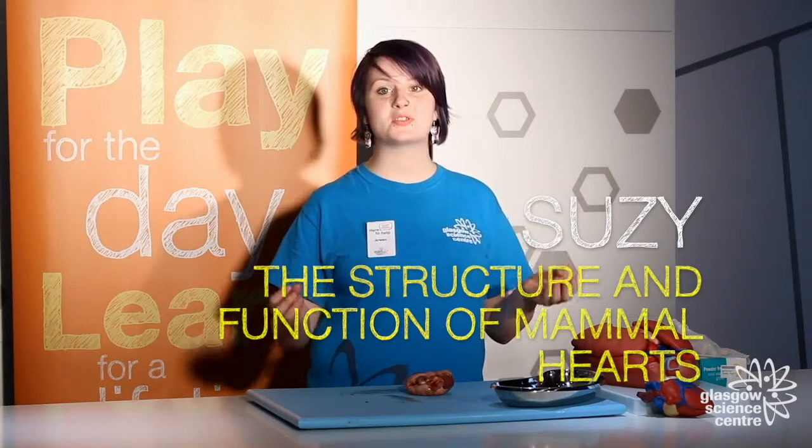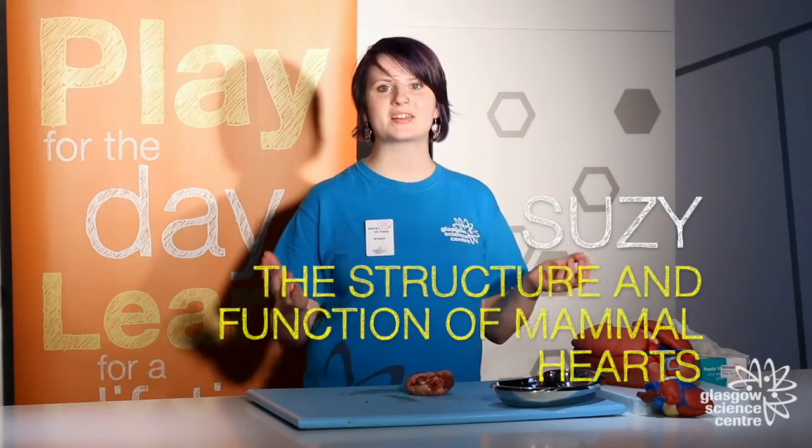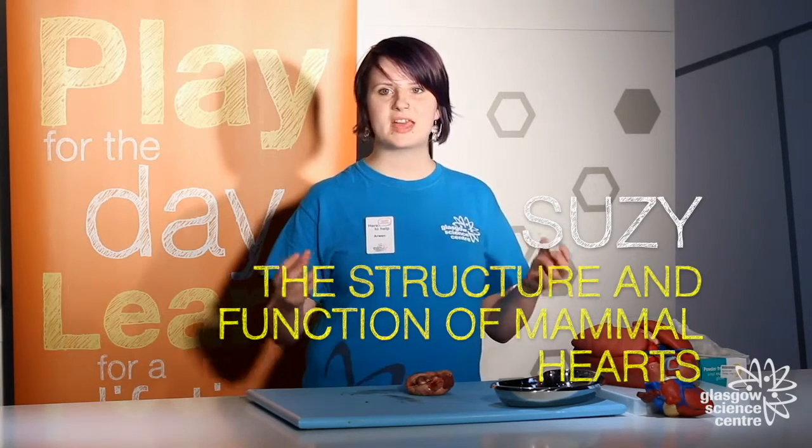Hello everybody, my name is Susie. Welcome to the Live Lab here at Glasgow Science Centre. Today we're going to do a heart dissection and learn about the structure and function of mammal hearts like our own hearts.